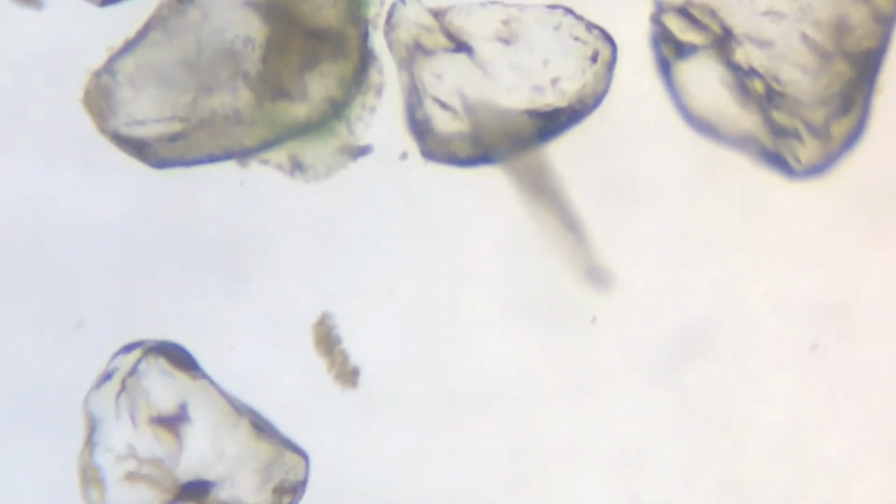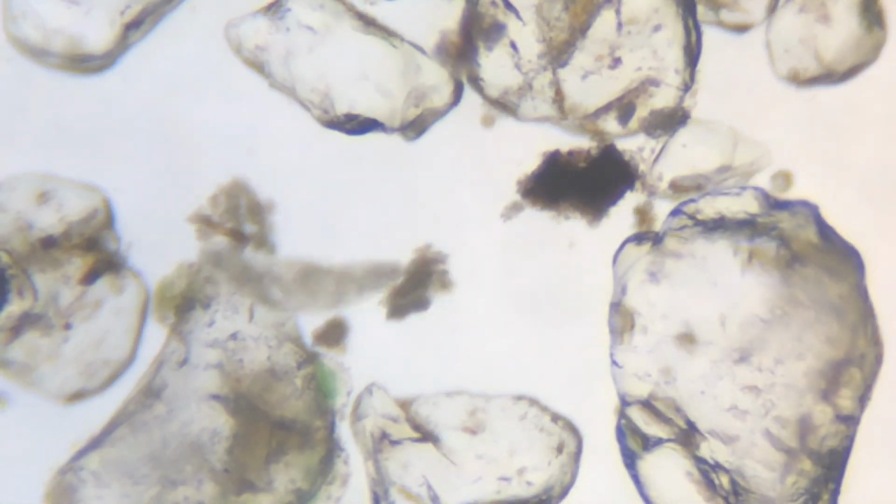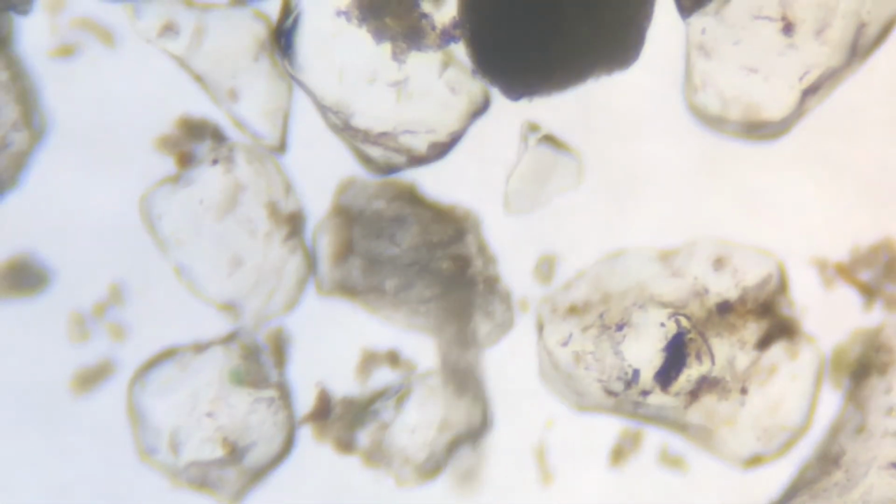Its brown color is most likely due to food granules, and since this was recorded at a low magnification, these granules cause the organism to appear brown.